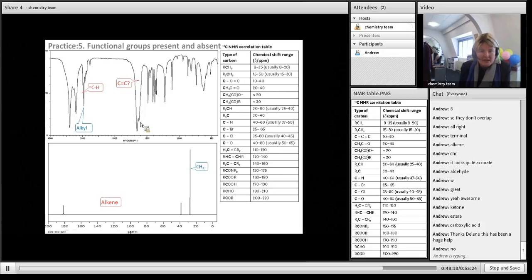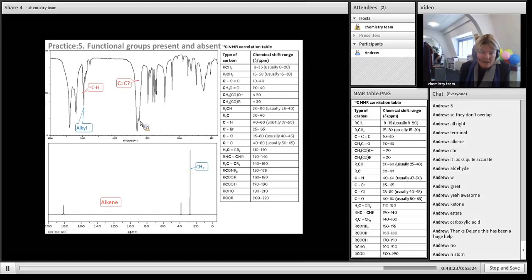There's no alkene. We don't see anything. You might be tempted to think this is part of an alkene. Okay, that's an easy error to make, and you could say, it's a twin peak. One of them might be an alkene. There's no problem with that. But then you can say, we know it's not an alkene because there's no peaks here in the NMR region between 100 and 150. And yes, it's a nitrogen atom affecting things, and we know it's the nitrogen atom. You'll see in the mass spec why as well, but the NMR also, IR clearly tells you as well. Remember, this twin peak is a primary amine.